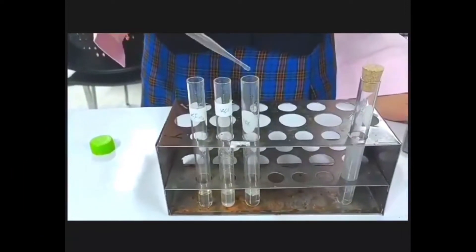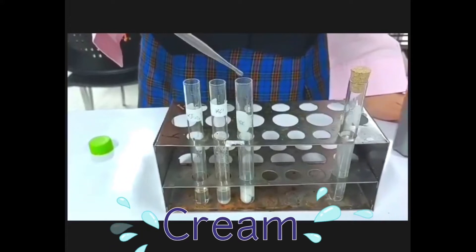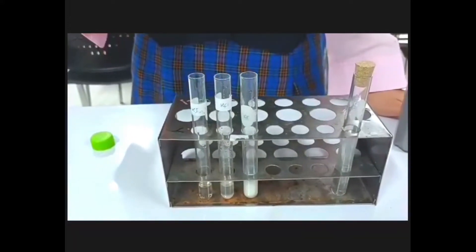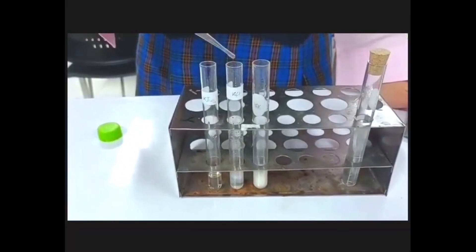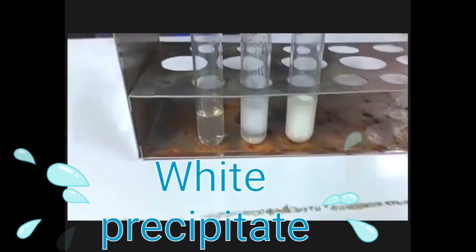So we're going to add some silver nitrate to the first one. We can see a cream color solution form. It means the bromide is present. And we add silver nitrate to the second one, which is chloride. It forms a white color precipitate.